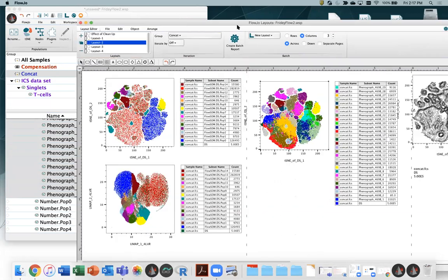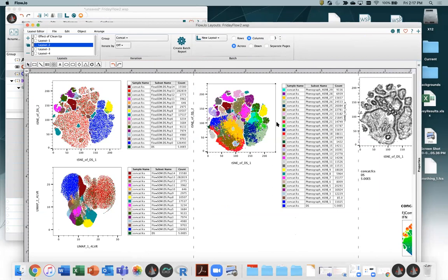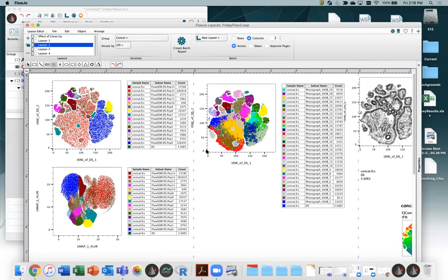All right, so there's our Phenograph results, but really broke down a lot of these populations even finer. Of note, we've seen in all these plots, there is this little population that stands out right here that is just visible throughout, that is just one population of cells that were particularly negative for interferon gamma, just a little different than everything else. Some kind of odd variant that so far only Phenograph, I think, has picked up as its own population. So that's kind of neat. If anything, perhaps it overclusters a little bit, and we may want to go back and compare some of these, but it's certainly not going to miss anything.